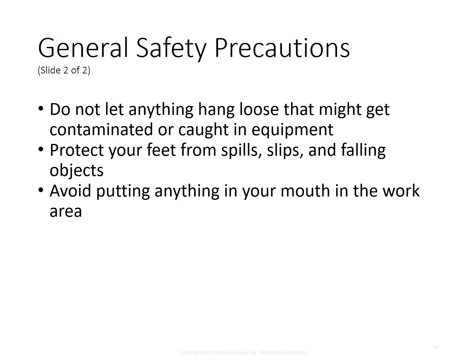Make sure you protect your feet from spills, slips, and falling objects. So make sure you wear shoes that are appropriate for the laboratory. Make sure they're not Crocs with the holes in them, or sandals or anything like that. Generally you want a hard top shoe. You don't want a needle going into your foot. And then avoid putting anything in your mouth in the work area.